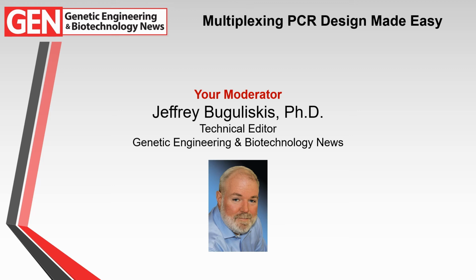Walk into any molecular biology lab these days and on any given day, invariably there'll be a PCR reaction ongoing. While PCR has been put to good use over the past 40 years and its ubiquitous nature makes it indispensable towards daily laboratory operations, the technique is anything but mundane, as researchers and companies are always finding new ways to improve the reaction. Recently, investigators have begun to capitalize on the fundamental nature of PCR through multiplexing reactions, saving them valuable time and money. Though multiplexing reactions can be a benefit to lab productivity, they are not without their drawbacks. The added parameters of multiplexed PCR reactions can dramatically increase the complexity of experimental design and validation to frustrating levels for many researchers. Thankfully, a host of computer software has been created to ease molecular biologists' multiplexing design woes.